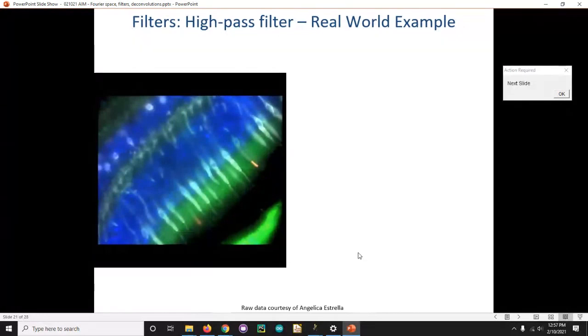you're always removing information. That's really important to keep in mind, because if you didn't collect much information about your image to begin with, say you took an 8-bit image, but even the highest intensity is only 100 pixel values, as you start to whittle away more and more information, you have nothing left. Your signal looks practically binarized. This is why you want to collect your image with as much dynamic range as possible. Even if it's really dim, just turn up your ADC gain on your camera or your photomultiplier tube to measure it as finely as possible.